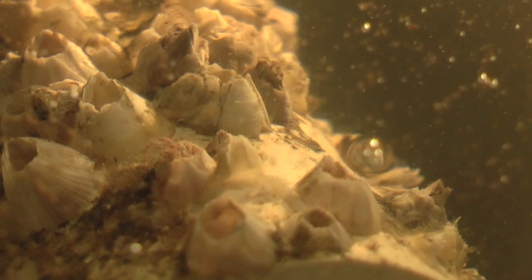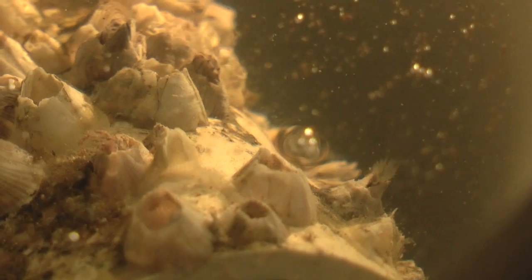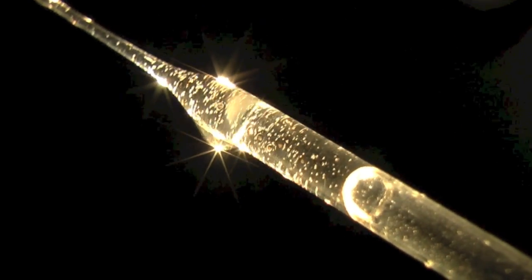When the barnacles are ready, they will begin releasing their larvae. Sections of the PVC pipe are set in a bucket in a darkened room. A concentrated light is shown through the side, and the larvae swim toward it. They are pipetted out of the bucket and into a jar.